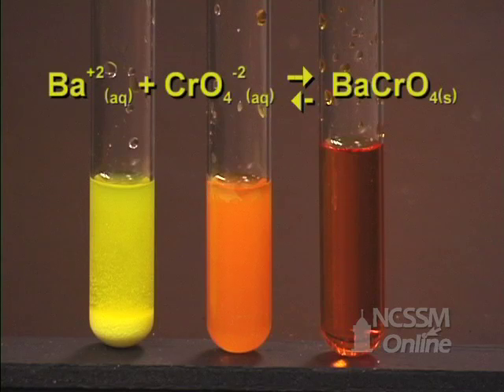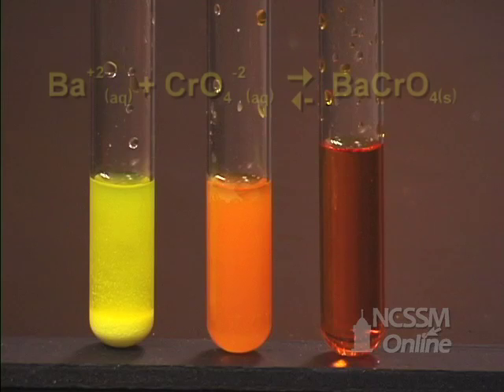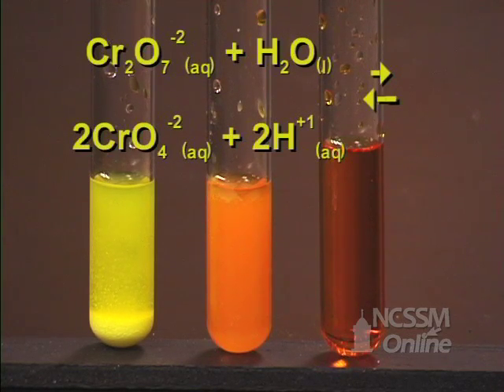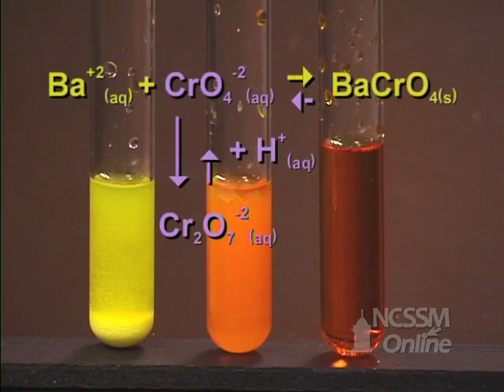In the first tube, there is a high concentration of chromate ion, so we get a large amount of precipitate. In the second tube, we only get a small amount of precipitate. This indicates that the equilibrium lies very far towards the dichromate side and only a small amount towards the chromate side. When we add acid to the third tube, it shifts the equilibrium in the reverse direction and decreases the chromate ion concentration to the point where no barium chromate forms.